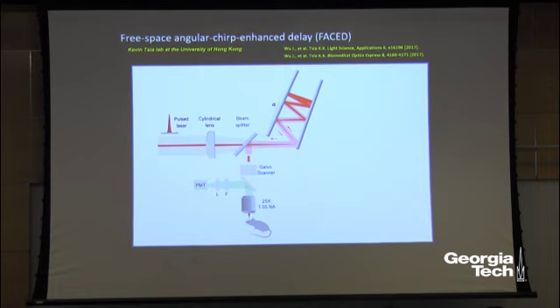Okay, so why do you go through the trouble to do this? The interesting thing is that if you look at a different beamlet, for example, this dark gray one, because of this cylindrical lens, it enters this mirror at a slightly different angle. So as a result, in this case, because the angle is smaller, it will reach normal incidence a little bit earlier. When that happens, again it will come out at a different angle, right, because it's a back retroreflection.